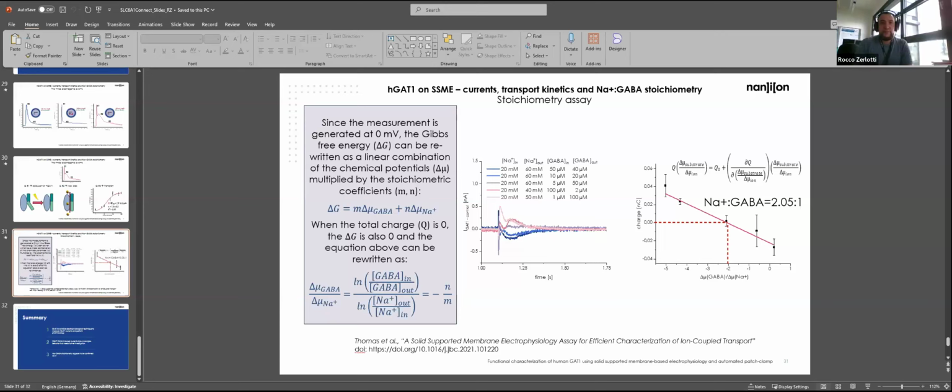Yes, thanks. That answers the question. Do you think that it's sodium selective, or do you have any data addressing that, the leak? So, sorry again, I kind of broke up a little. Do you think that the leak conductance is selective for sodium?